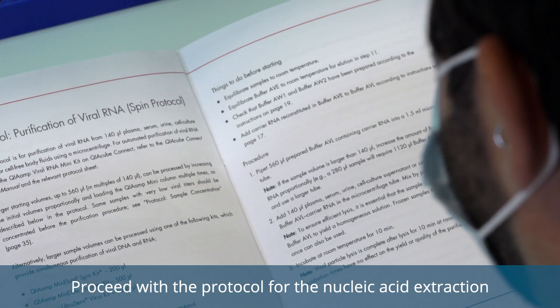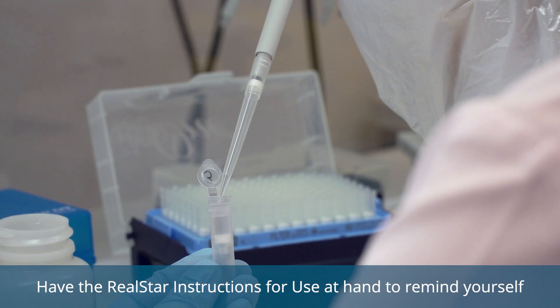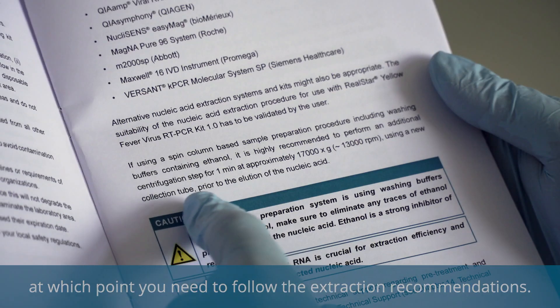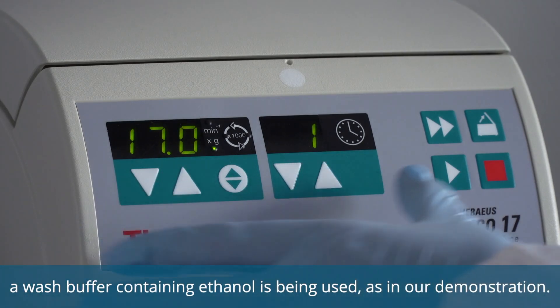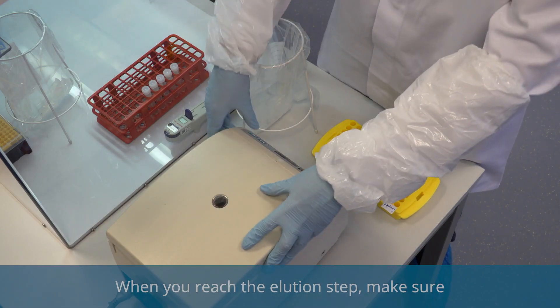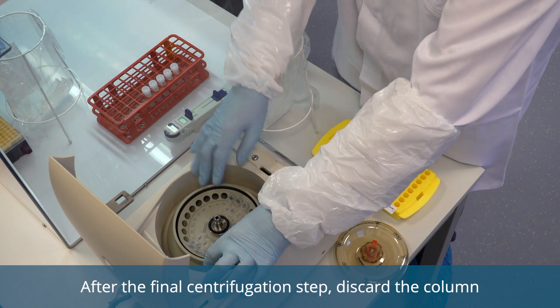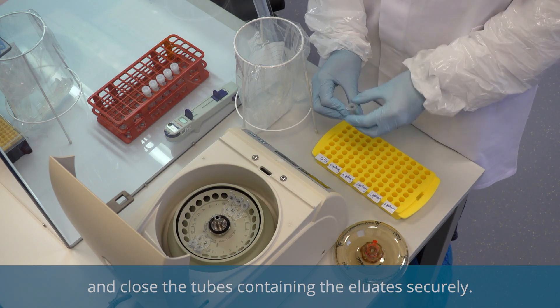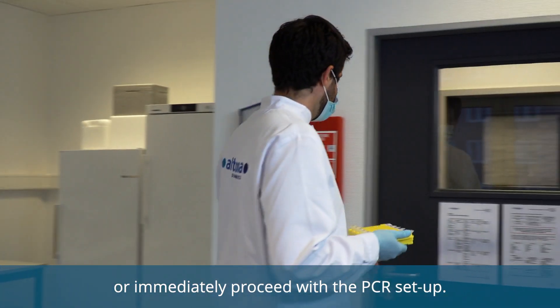Proceed with the protocol for the nucleic acid extraction as described in the instructions for use. Have the RealSTAR instructions for use at hand to remind yourself at which point you need to follow the extraction recommendations. For example, the additional centrifugation step should last one minute if a wash buffer containing ethanol is being used, as in our demonstration. When you reach the elution step, make sure to use the new labeled tubes that you prepared initially. After the final centrifugation step, discard the column and close the tubes containing the eluates securely. You can either store the eluates at minus 20 degrees Celsius or immediately proceed with the PCR setup.